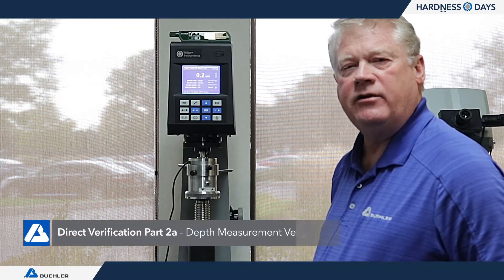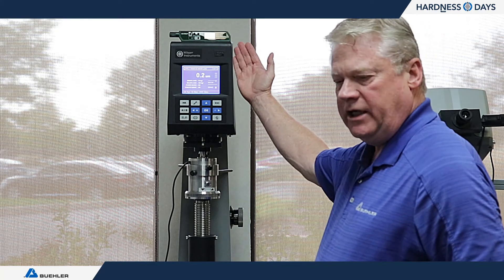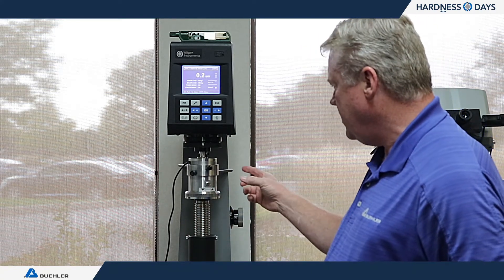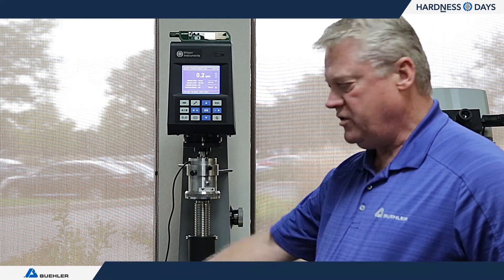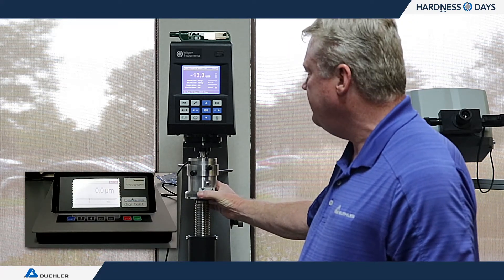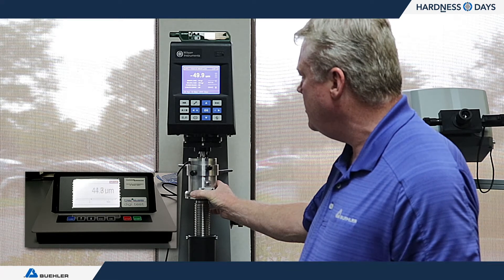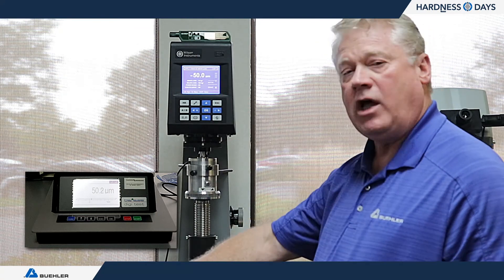The next section of E18 is verification of the depth measuring device. On the R574, it's a direct linear encoder sitting right on top of the indenter plunger. I use a special tool called a CalRock — a high-precision electronic encoder that monitors travel in the machine per the standard. I zero out my tool and the machine, then move the device up approximately 50 microns. The result reads 50, and you can see the gauge moved to 50.2 — correlating to our 50 microns, so this is in compliance.